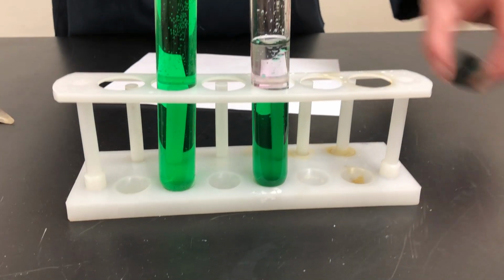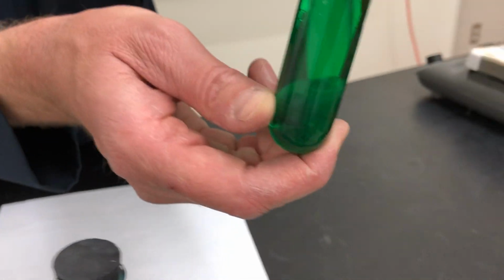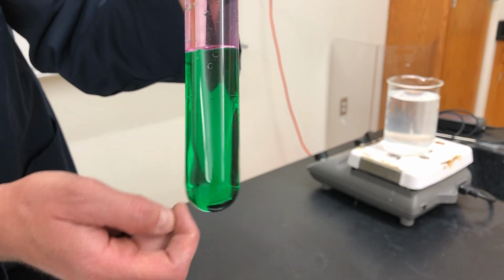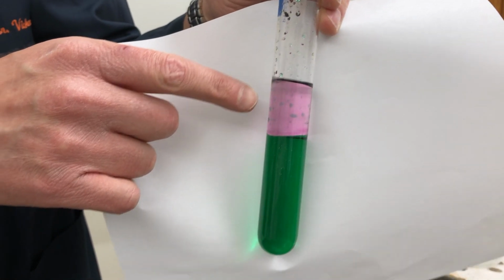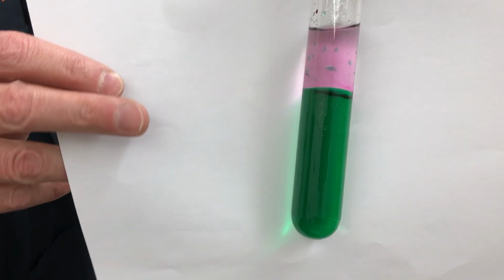All right, so I'm going to drop this in here. And where does the iodine go? Well, if you have a sharp eye and my video was high def enough, you might see that some of the iodine is kind of stuck on the surface of the water layer. Some of it may have sunk all the way to the bottom of the water layer, because that solid is more dense than anything in here, and so it goes to the bottom. But as you also may notice by the discoloration of the hexane there, some of that iodine dissolved in the hexane on the way down.